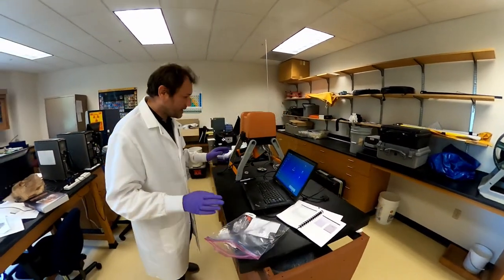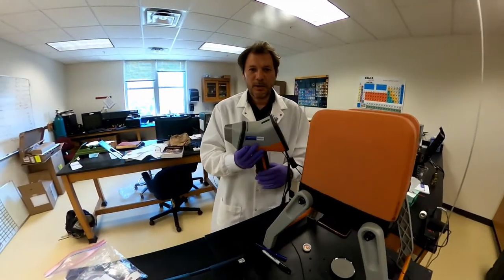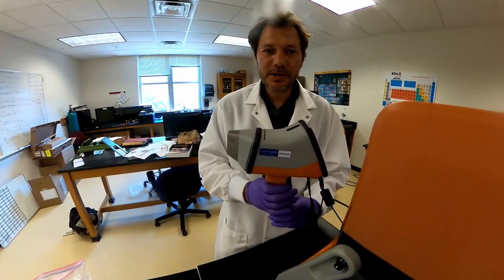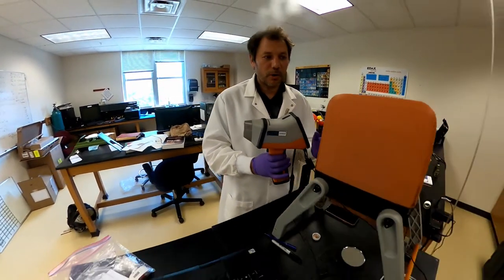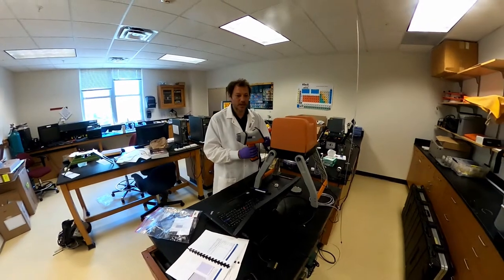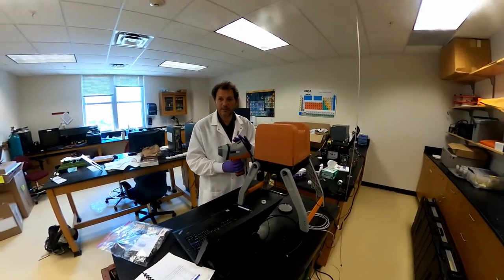So the XRF instrument is that instrument. This one is a portable XRF. There are versions that are more bulk, also a bit more precise that can stand on their own but you cannot bring them in the field. This one you can bring it in the field.